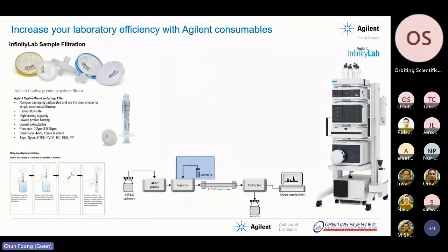Here the choice of syringe filter is another thing that we need to take note of, because basically there are two types of syringe filter, by pore size: 0.2 micron and 0.45 micron. So it depends on the columns and also the LC system that you are using.